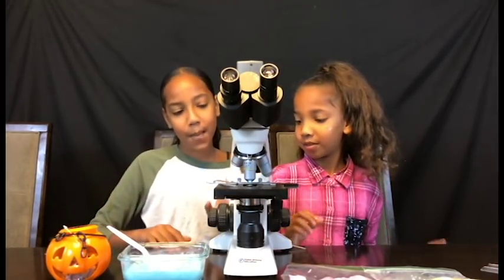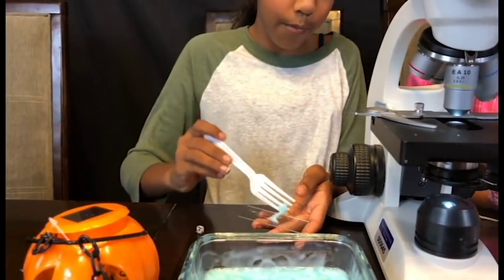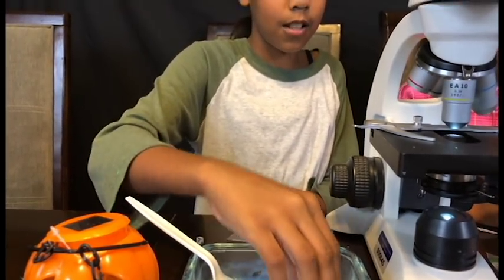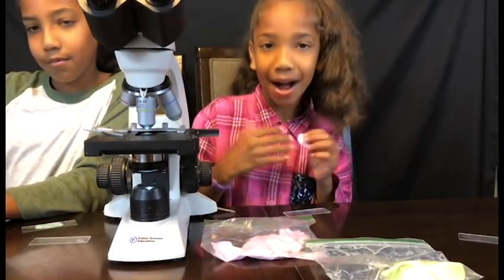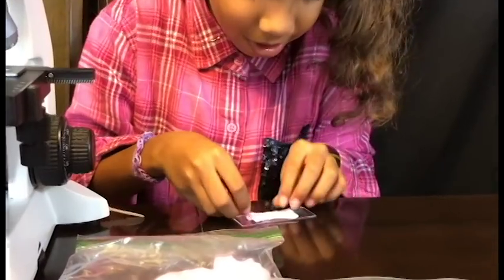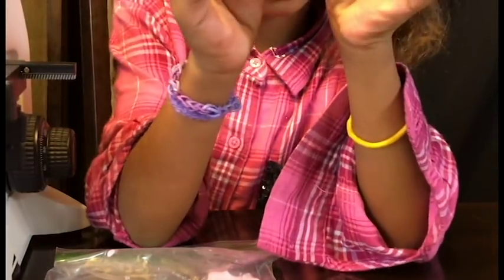Now we're gonna prep it. Gonna take my slime, and the first one I'm gonna do is the non-glue slime. I'm just spreading it so you can actually see it underneath the microscope. Now I'm gonna prep mine — I'm gonna use my non-fluffy slime and just spread it out so the light will shine on it. Now it looks like this and it's beautiful. Now to check it!